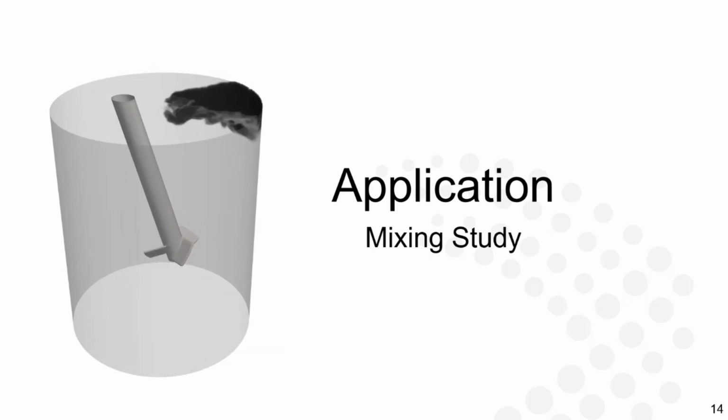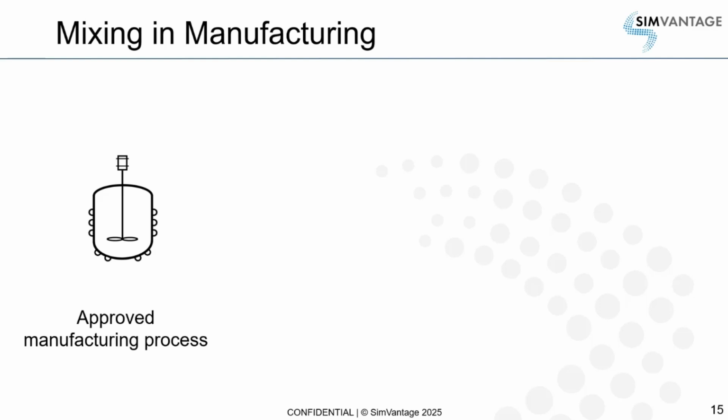Now I would like to show you an application of this software in a mixing study.